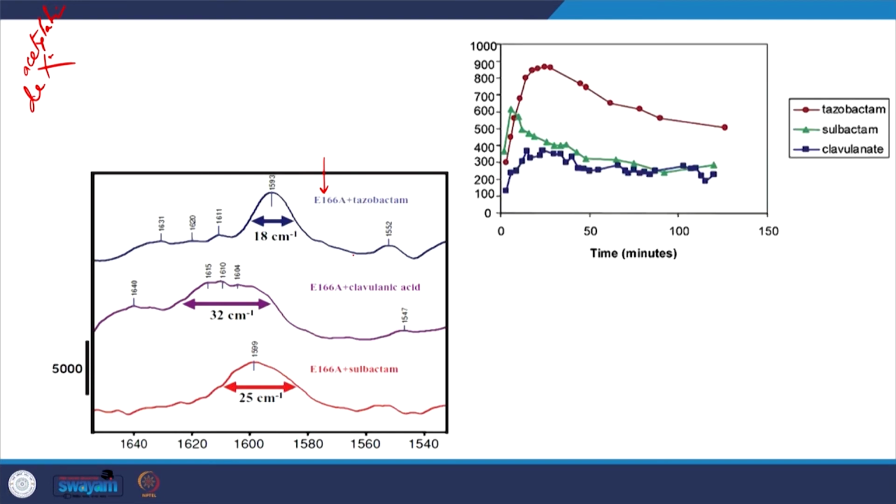Before that, using kinetic studies, we were not, I would say, specific enough to demonstrate the effect of these three mechanism-based inhibitors, but now we have specific determinants.